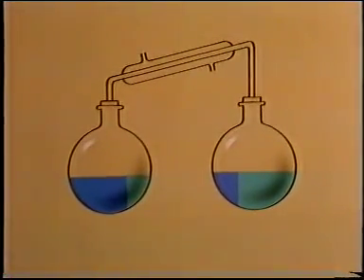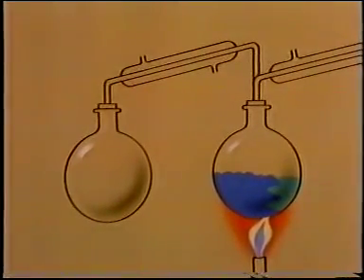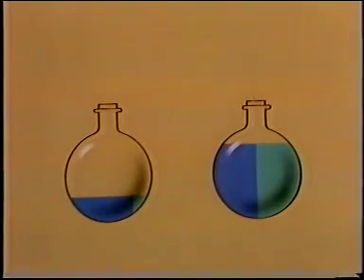The distillate is richer in the liquid of lower boiling temperature, and the residue richer in the liquid of higher boiling temperature. If the distillate is redistilled and we again collect about half the mixture, this distillate is mostly the liquid with the lower boiling temperature. It is a fairly pure sample of this liquid, but we have only recovered about half the amount that was present in the original mixture.